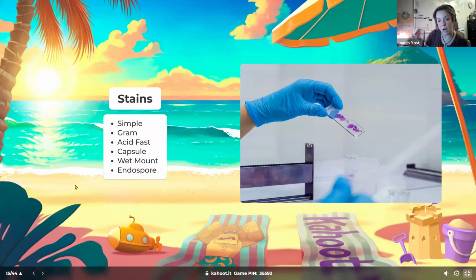And the endospore stain, this was one where we create our normal smear, we heat fixed it, then we added our malachite green to it. So something I want to be very clear about here. What was forcing the malachite green into the endospores was the steam. The only reason that we had the paper towel on there was to help keep the stain localized over our smear that we heat fixed.